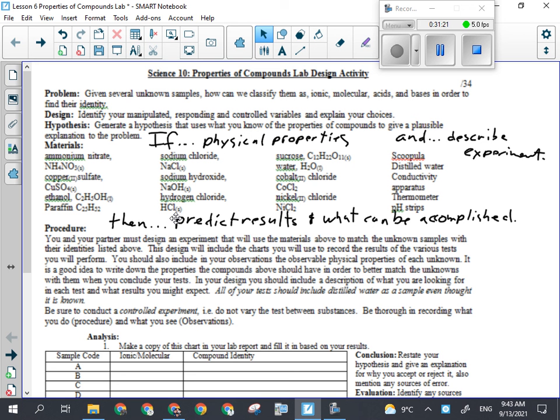Okay, so imagine this was my solubility test. Even with that small amount of salt, I'm having a hard time getting it all to dissolve, but if I gave it a minute, I'd probably get it all out. With this filled only a quarter to a third of the way, you're probably not going to get that much salt to dissolve, but will you be able to tell if it's soluble? Yes, because you'll get most of it to dissolve.